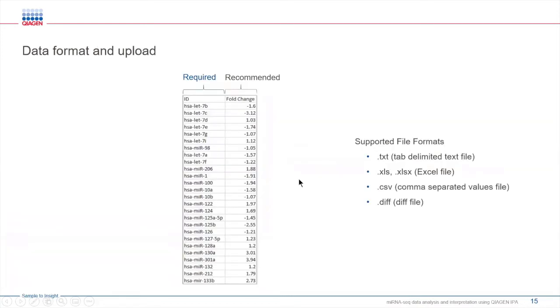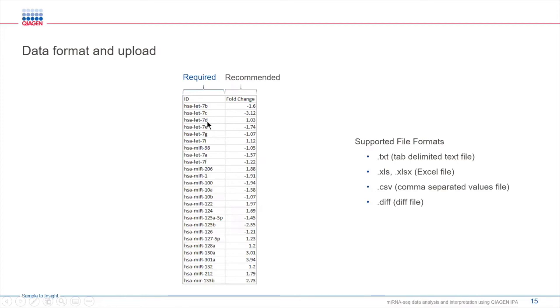Today we're going to start with the microRNA dataset. The format and upload of microRNA data is very similar to uploading other datasets in IPA. It only really requires a list like this, this list of microRNAs. And it can be in text, Excel, CSV, or DIFF formats.